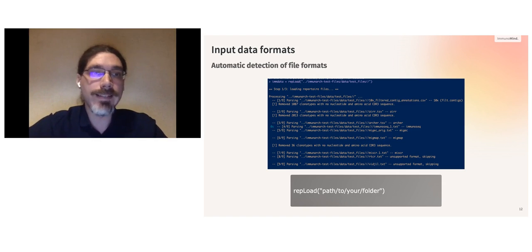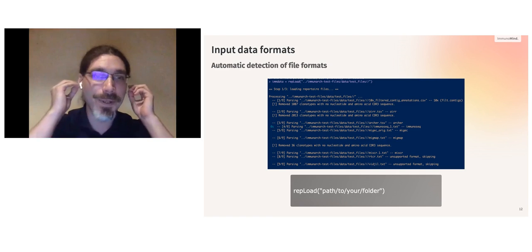On the screen, you can see a screenshot with outputs from this function, and the function outputs the information on what files it automatically detected, and what files are not supported. In the bottom of this screenshot, you can see there are file formats of RTCR and other software that is not supported today, and the function just skips them instead of failing with an error.